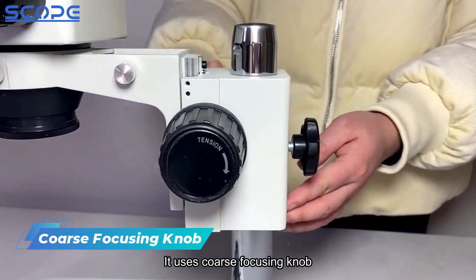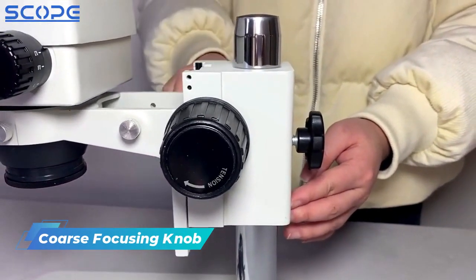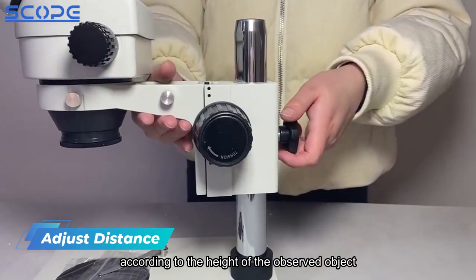It uses a coarse focusing knob, and the coarse stroke is 50mm. The up and down distance of the head can be adjusted according to the height of the observed object.